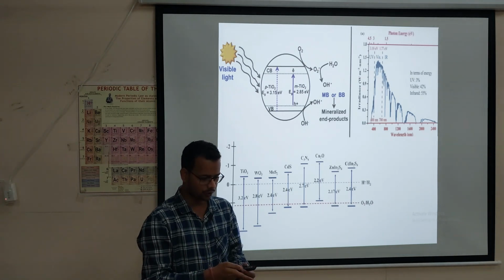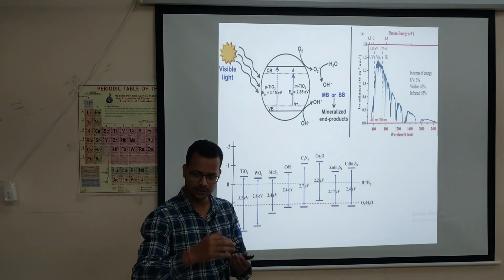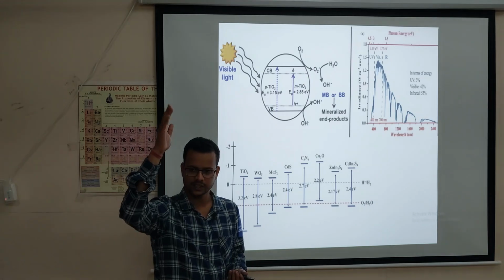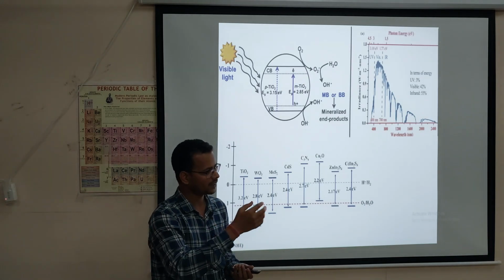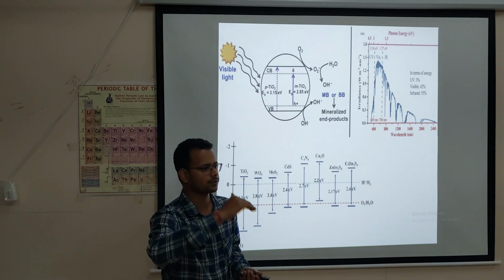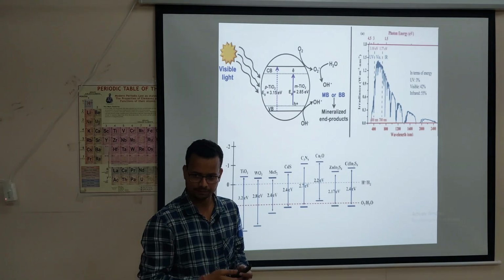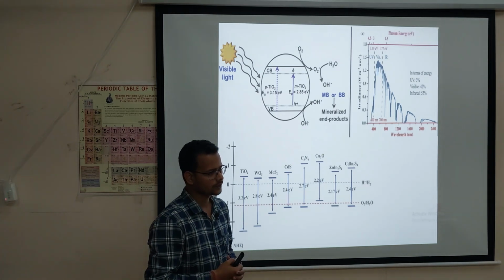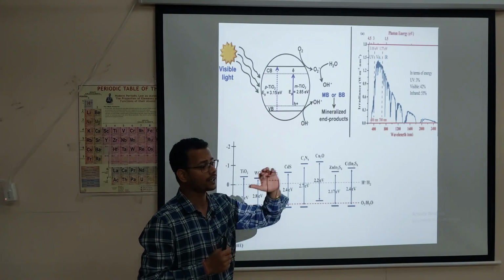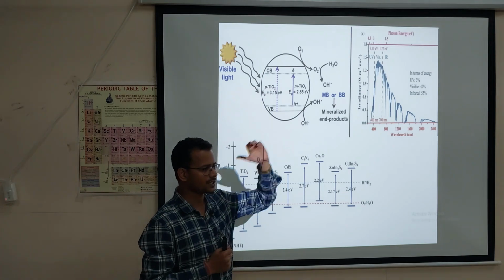If you throw a ball with different force, the ball will reach different heights. Like that, different metals have different light absorption capacity, and on that basis the electron jumps differently, so the conduction band is not fixed. It is an imaginary state up to which the electron will move, touch that point, and come back.